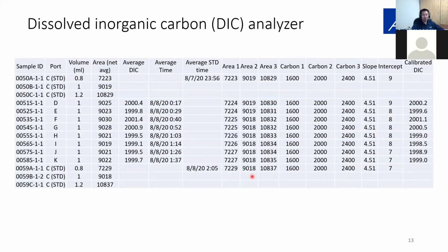But if you want to correct for the drift, this example shows you how to assume that the area changes linearly with time and how to calculate a concurrent hypothetical standard curve for that sample. As you can see, the correction is very small. It's still within 0.1% as the precision we maintain.